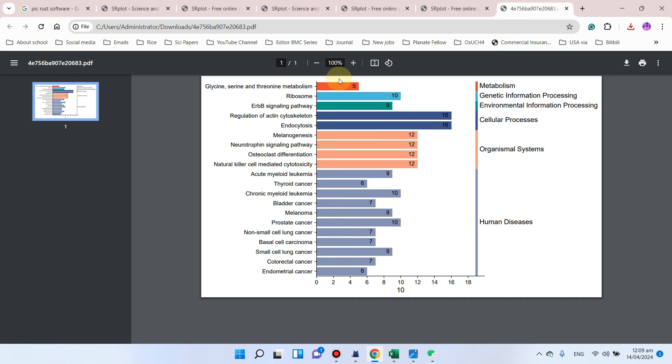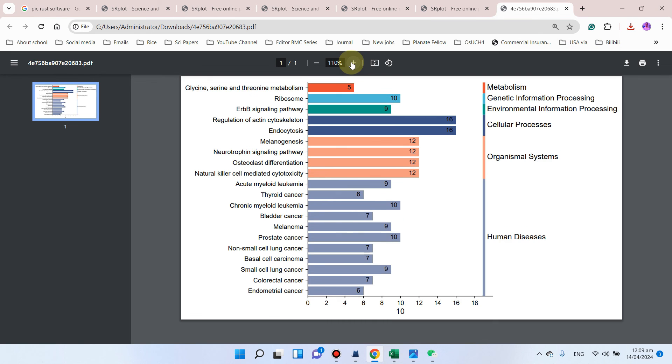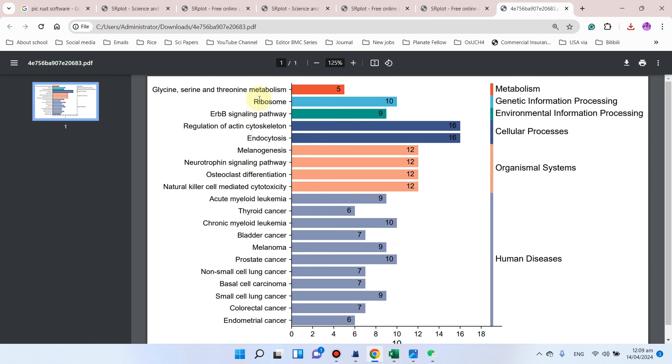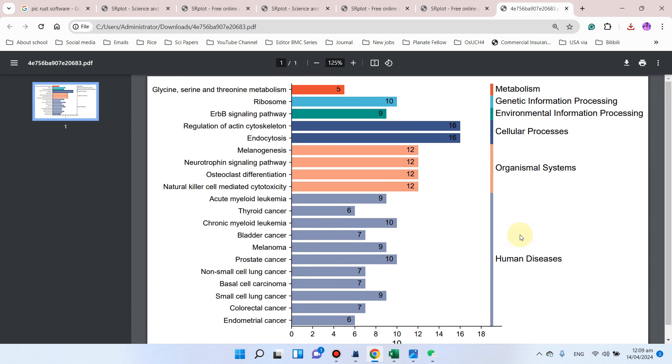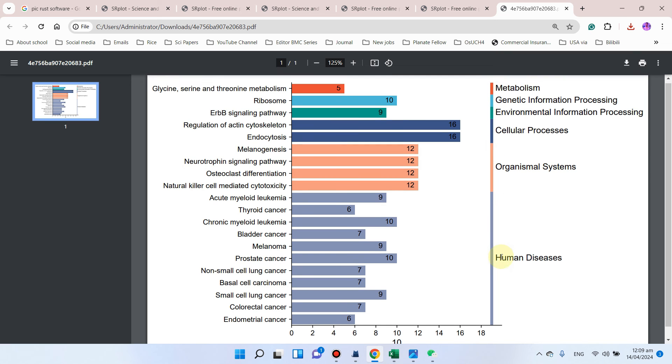Here you can see our KEGG summary plot is ready. On this axis there are the KEGG pathway names, here are gene counts, and here are their divided categories.